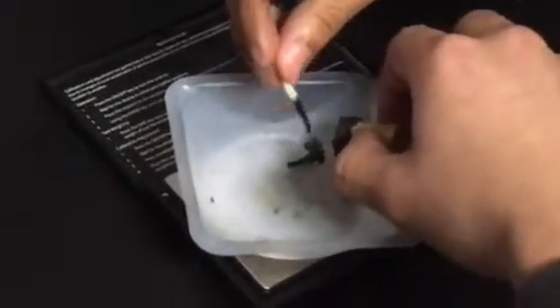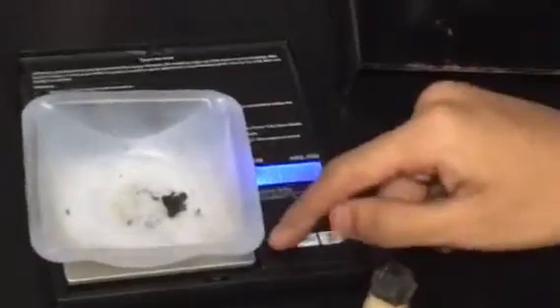It's not gonna weigh anything. Hold on, let me take it out there. Does that weigh anything, sir? What is it? That was perfect. Hold on, hold on. Hey, we'll call you Meanie Me.